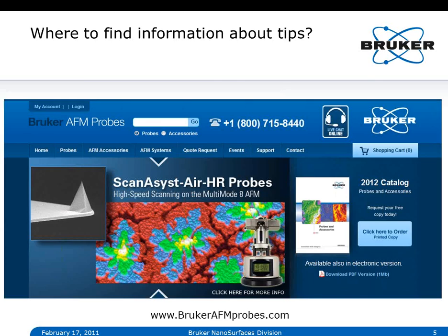Now, where do we find information about tips? You can go to Bruker AFMprobes.com, and there is a variety of information. You can either type in information about a specific probe that you're interested in, or you can look at suggested probes based on the instrument that you're using or the application that you're interested in. A quite useful site, check it out. There's also a probes catalog electronically available that you can download and take into the lab to always have this information handy.